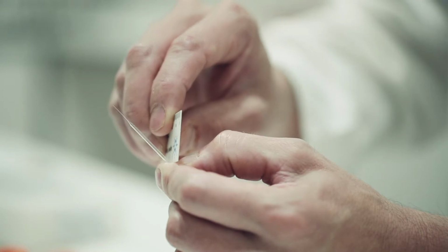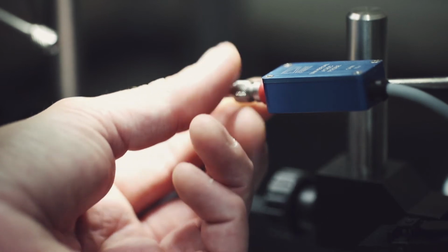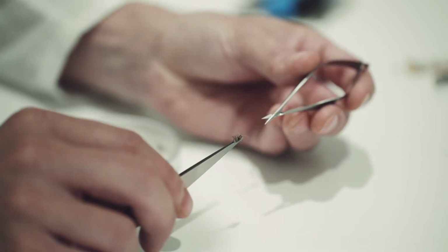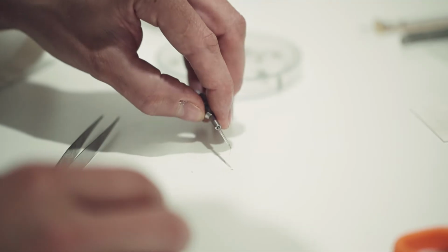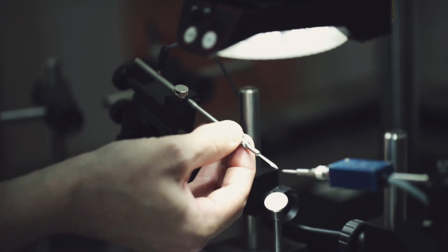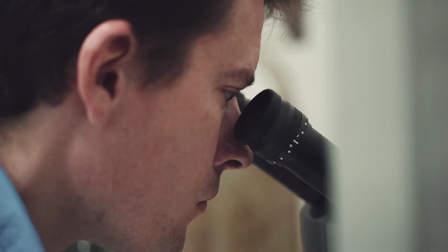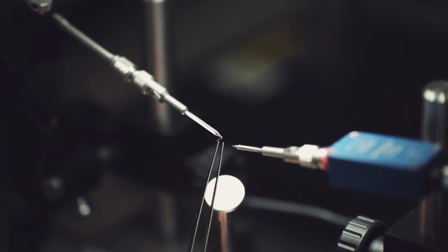We typically link a gas chromatography machine to an electroantennogram detector. Basically what that system does is it gives us information about what an insect can smell. Typically one would remove the antenna from an insect and then couple it to electrodes, and these electrodes then measure the potential across the antennae, and while we have that antenna coupled to the electrodes, we then blow the sample of the pheromones over the antennae, and then we record chromatograms and electroantennographic responses from the antenna.